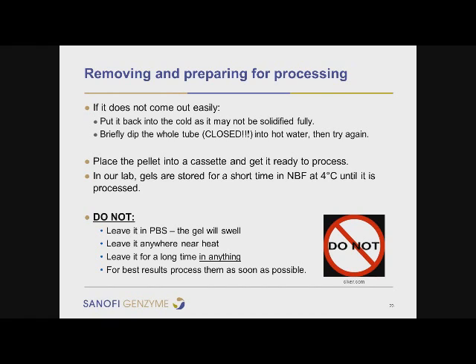In our lab, gels are stored for only a short time, and usually they're in formalin in the refrigerator until it's processed. A couple do-nots here, because there's always a few do-nots, right? It's important not to leave it in PBS or saline because that gel will swell. It's also important not to leave it anywhere near anything warm. We found out that the hard way. It's also important not to leave it for a long time in any solution. So for best results, you should try to process them as soon as possible. Usually I will try to schedule with the processors to do them that evening.